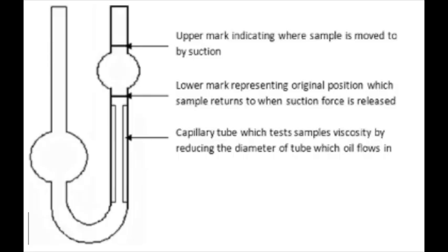A capillary viscometer or an Ostwald viscometer consists of two reservoir bulbs and a capillary tube. It will be filled with liquid until the liquid reaches the upper mark, with the aid of a pipette to accurately measure out the volume of needed liquid.